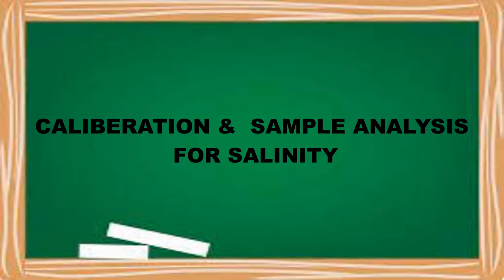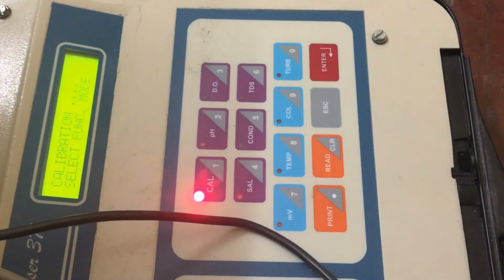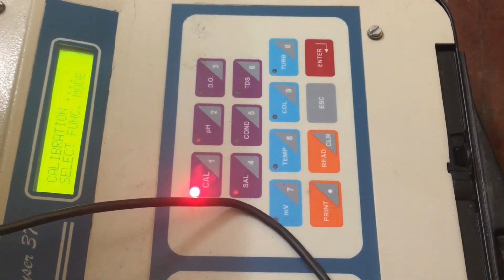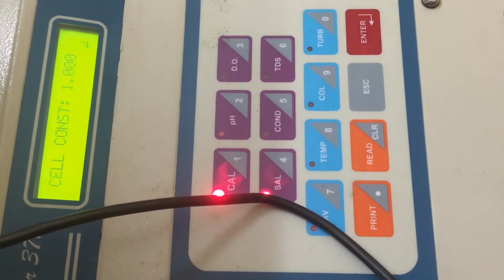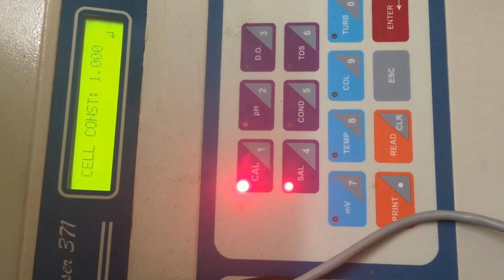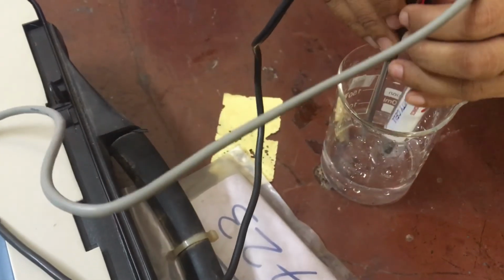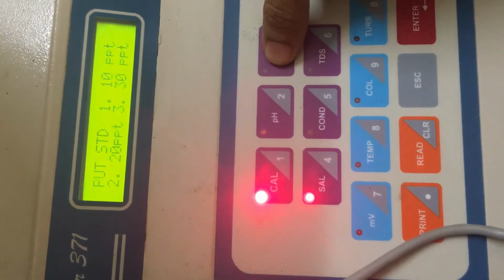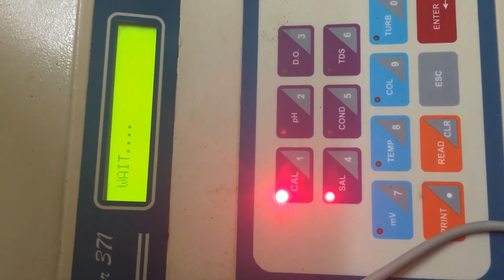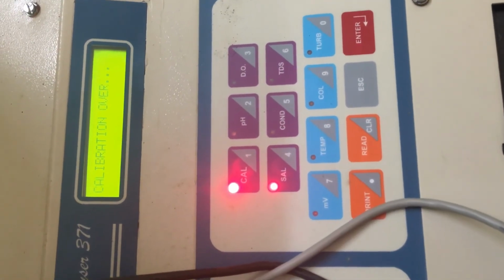Okay, next we are going to do the calibration and sample analysis for salinity. For that, first we need to press cal and then select the parameter that we are calibrating, that is salinity, and it will display the cell constant. Again we need to press enter. Then it will show to put the standard. Here the standard we are using is 30 ppt NaCl, and then press the digit corresponding to 30 ppt that is displayed on the screen, that is 3, and on pressing that it will display wait. Finally it will show calibration over.